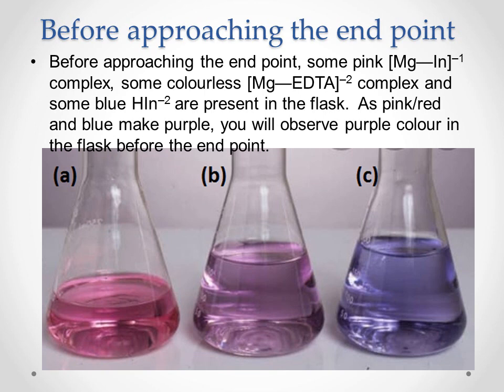जब magnesium EDTA complex form हो रहा है तो magnesium indicator का जो complex था obviously that is releasing the indicator free. So indicator in the form of blue color is appearing. So ये जो pink, red और blue color है, it will appear in the form of purple color. You can see in the picture below the B conical flask जो आपको purple color show कर रहा है.